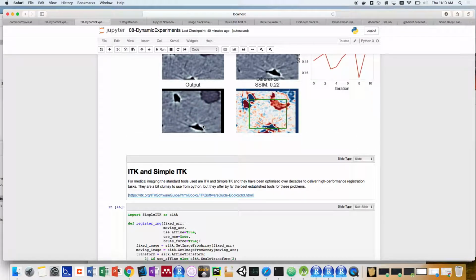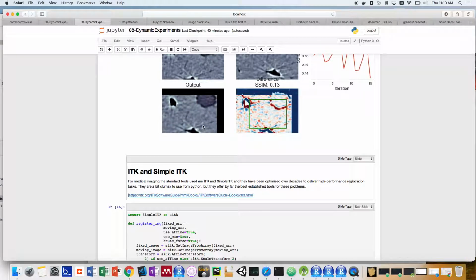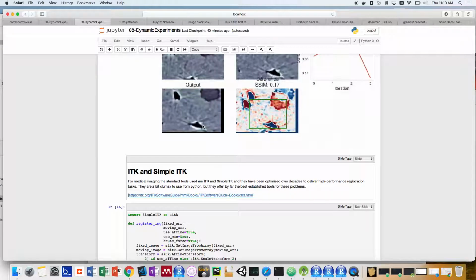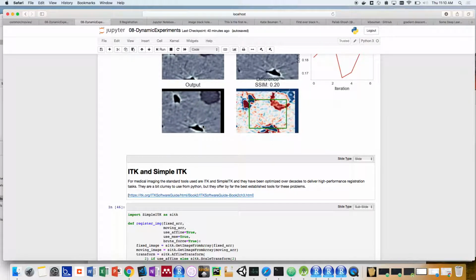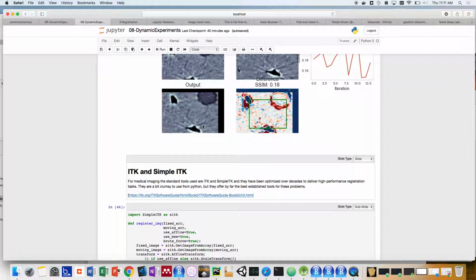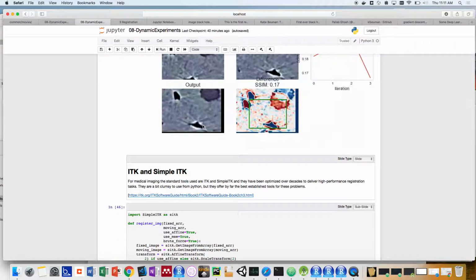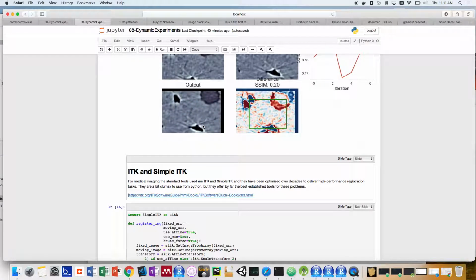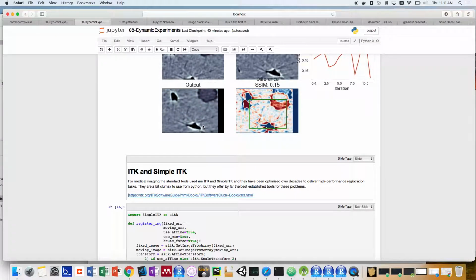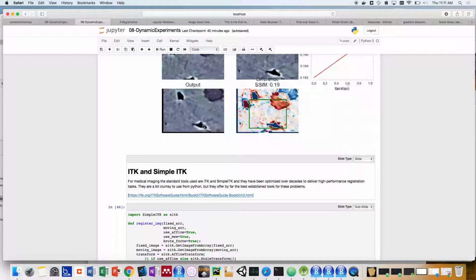This system, if I see correctly, works when a shape is consistent. So if there is something slightly changing over time for growth, it won't work. Right? Well, it can still work well, but you'll probably want to make sure you have the right sort of features in your image. With the distance map transformation, a slightly larger object still matches up quite well. But the actual image overlap might be very poor.